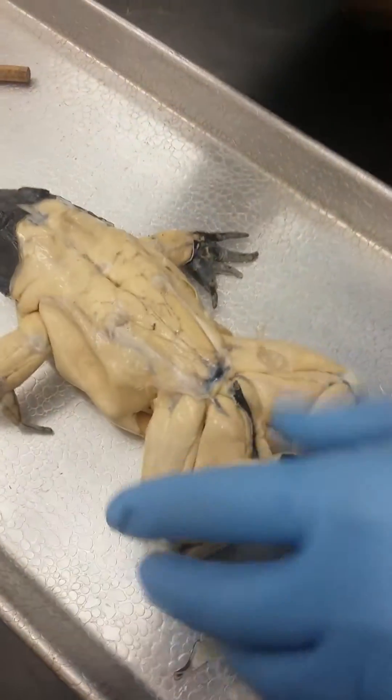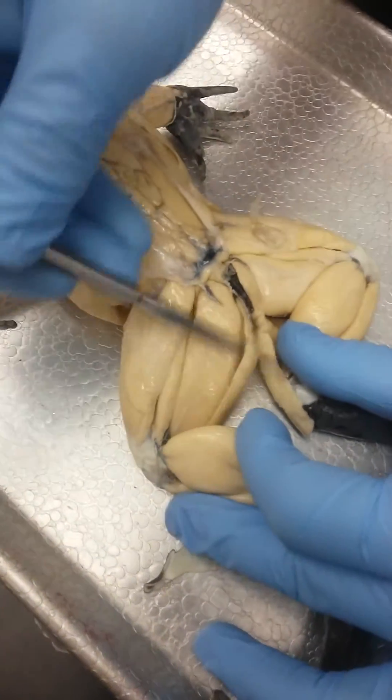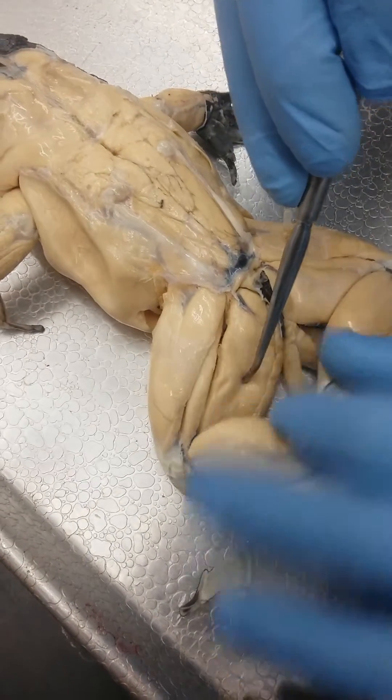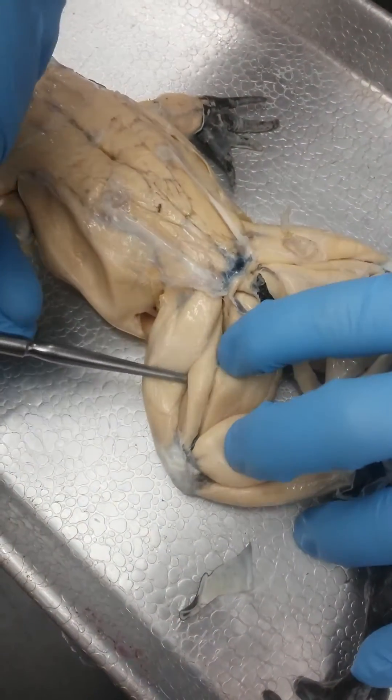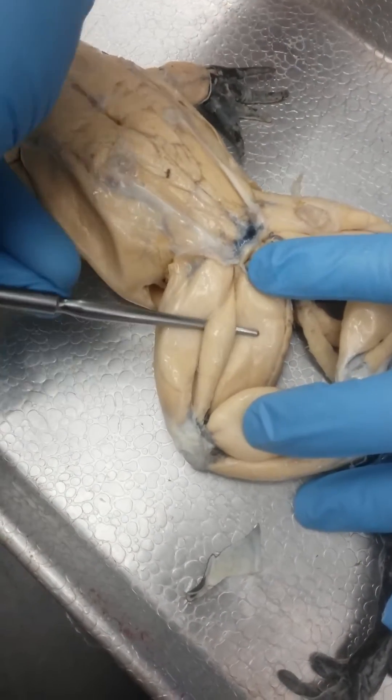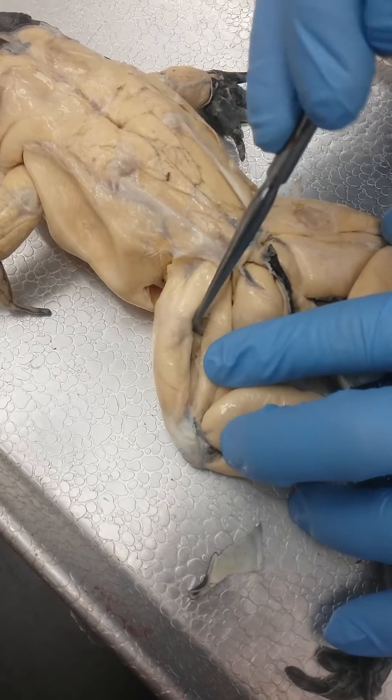If you flip over, this is again gracilis minor, and this right here is semitendinosus. This here is biceps femoris. And then this top piece is triceps femoris.